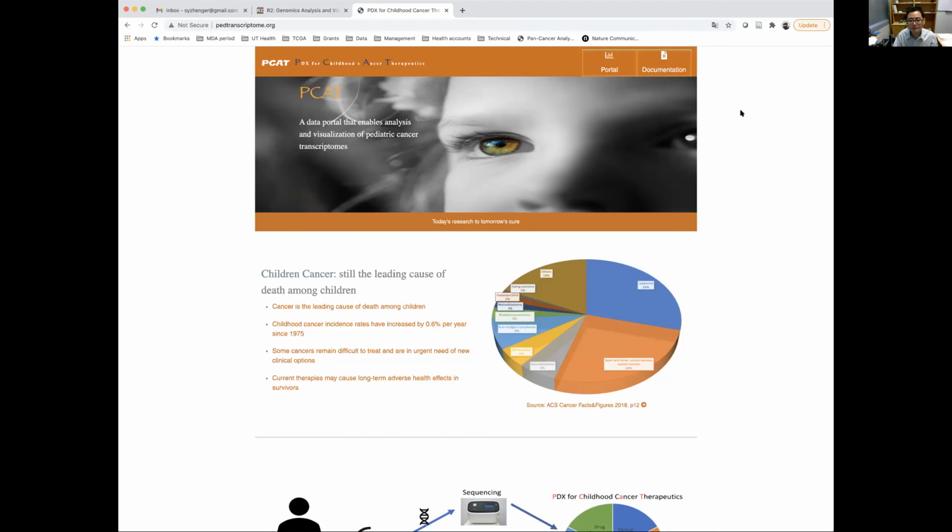Yeah. So the other quick question as well. Now long read sequencing is gradually getting in there, even though the accuracy is still kind of problematic. But for fusions, that sounds like it's ideal. No doubt, long read sequencing would be ideal for fusion detection and also for alternative splicing analysis.